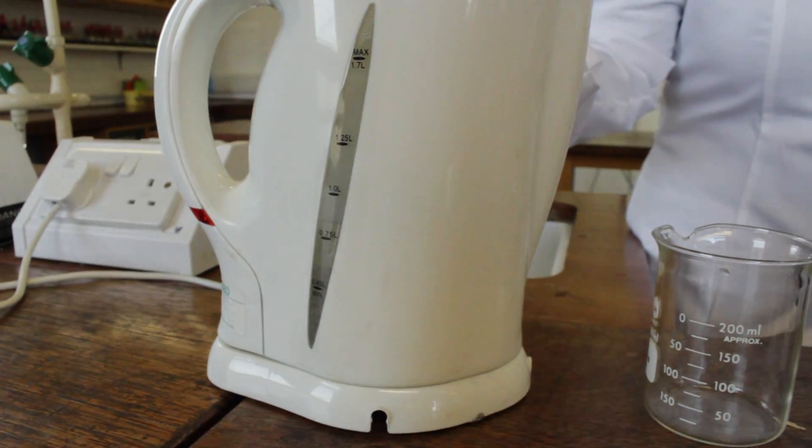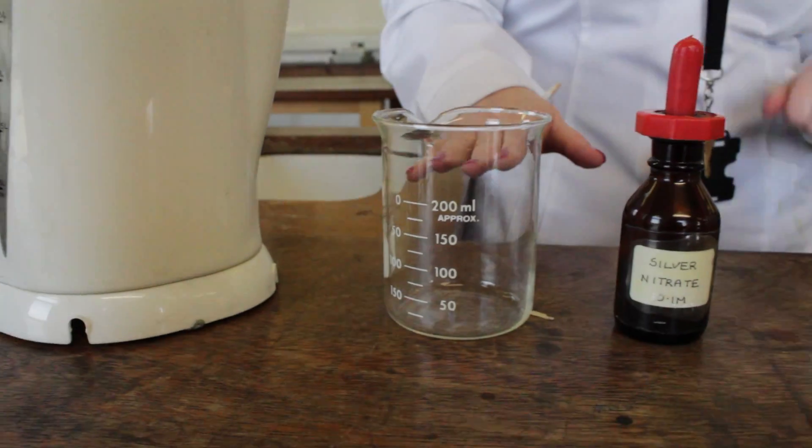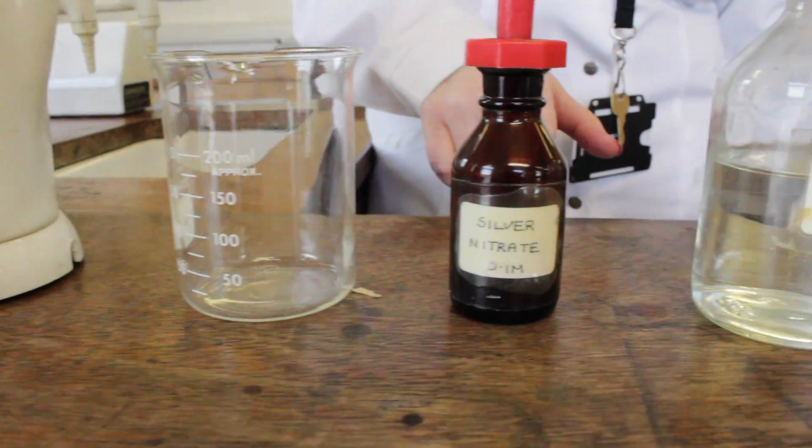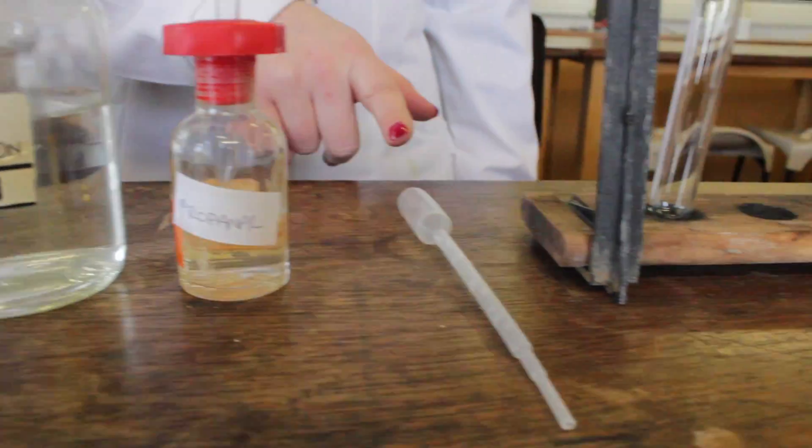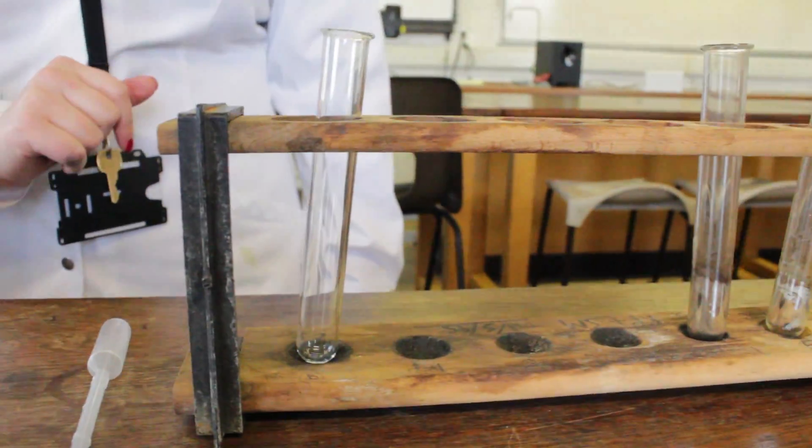We have some hot water, a beaker, silver nitrate solution, ammonia, propanal, a pipette, and a clean test tube.